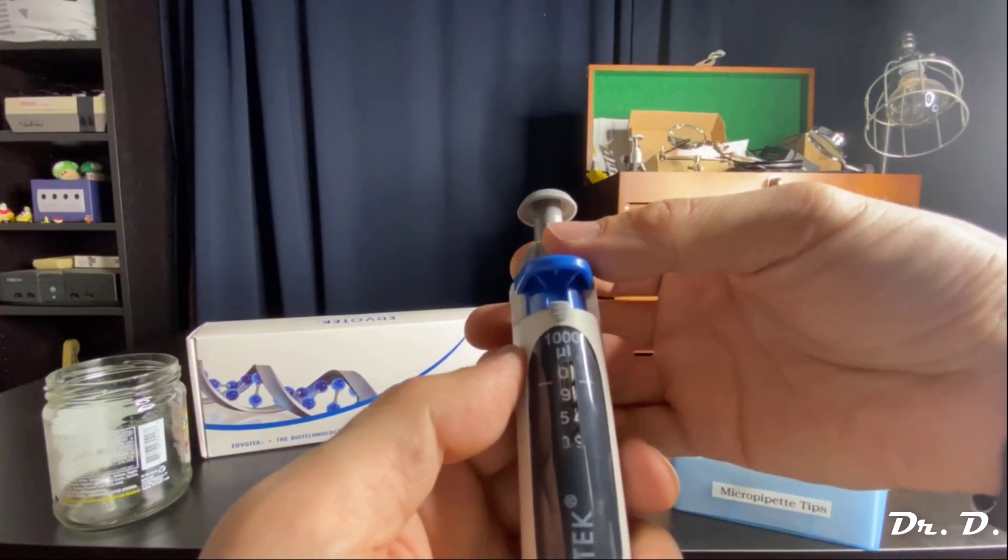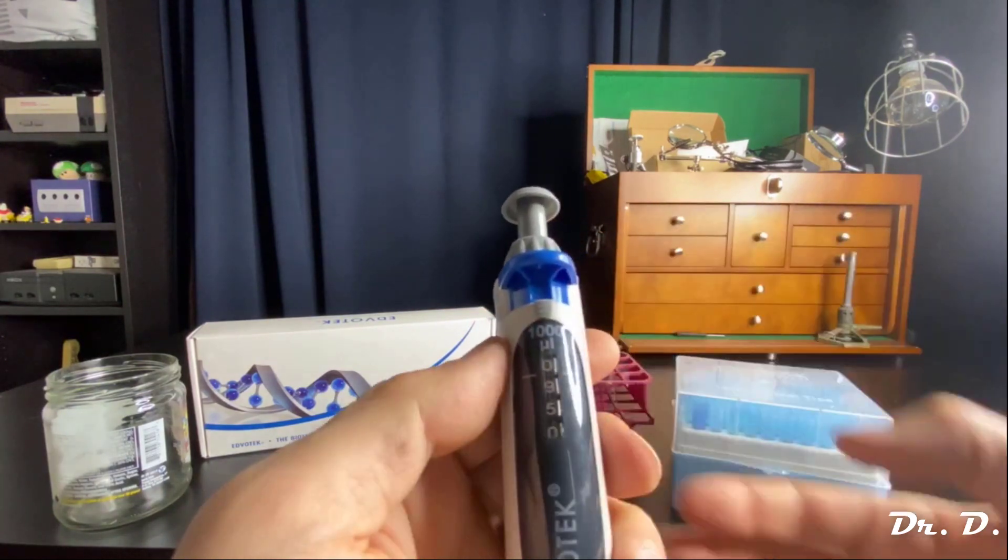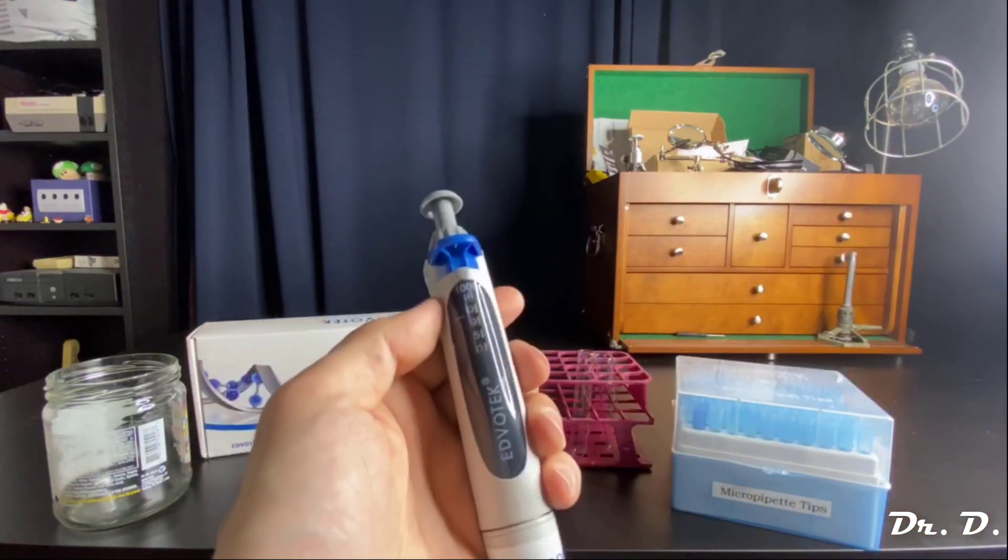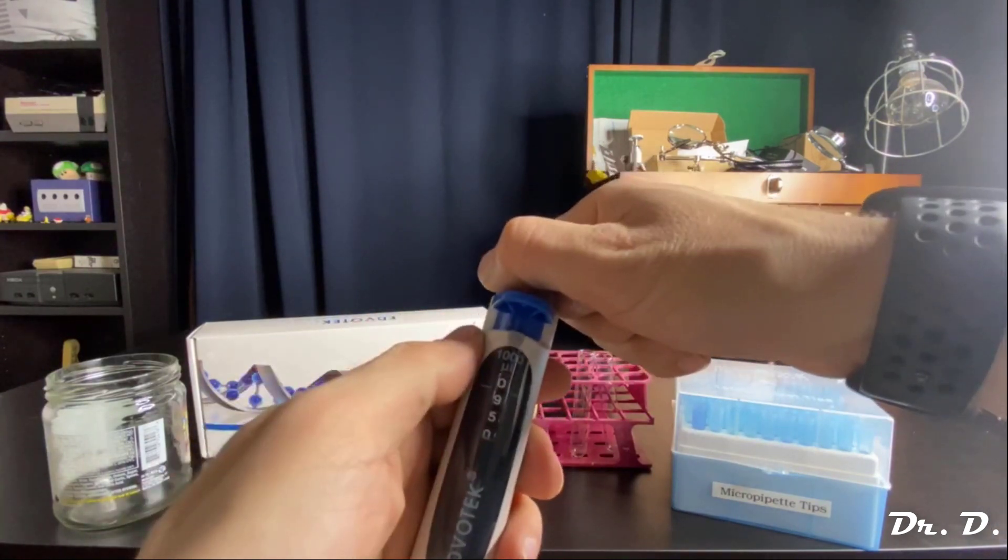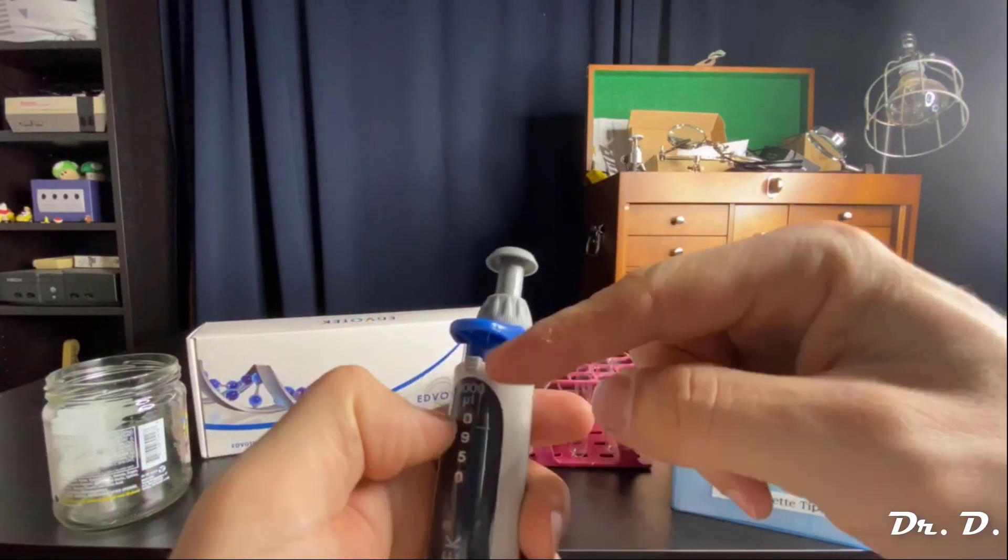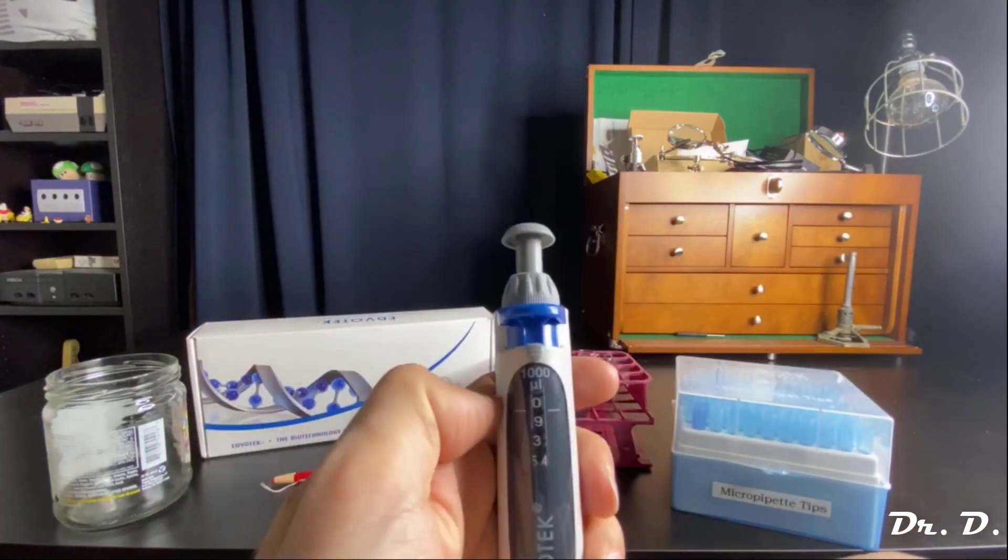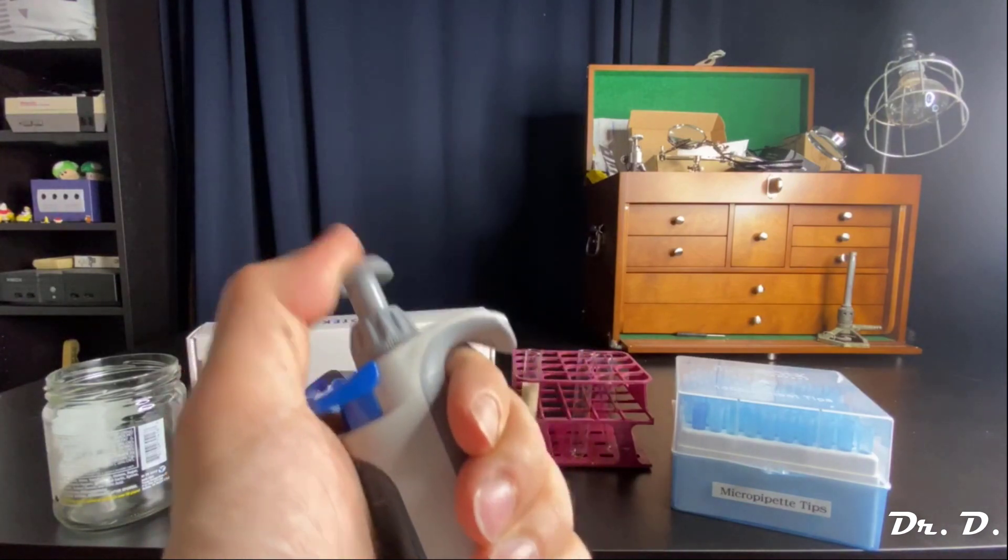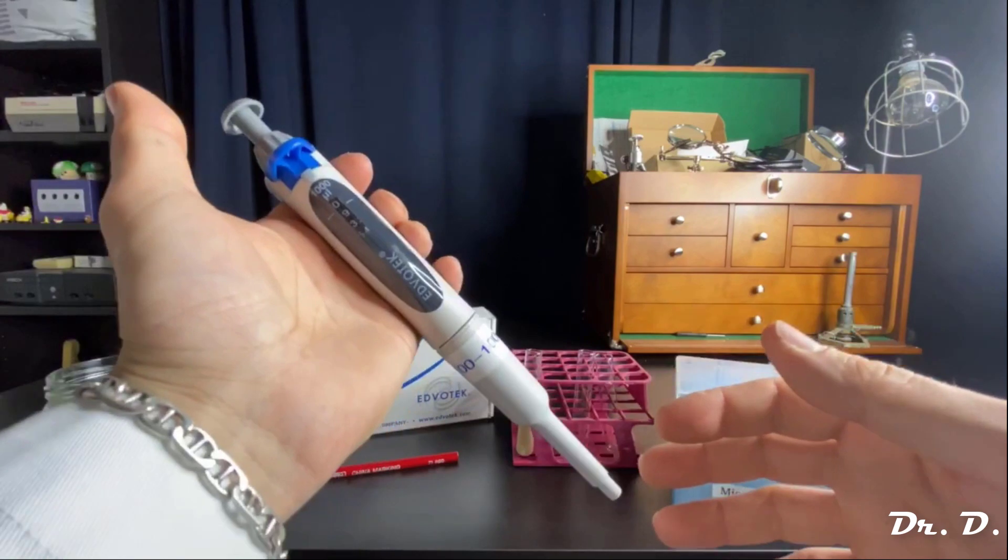Let's say I want 950 microliters. I would set it to 950 microliters and then engage the lock again. So just keep that in mind. If you're trying to turn it and it's not budging, don't force it. You will break it. Undo the lock to change the volume, then push down on the lock to lock it so that you don't lose your setting when you're doing the actual pipetting. So that's how it works.